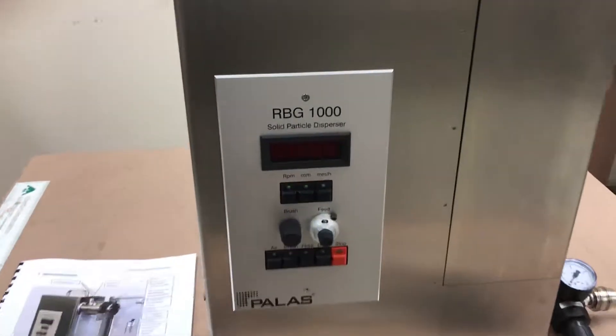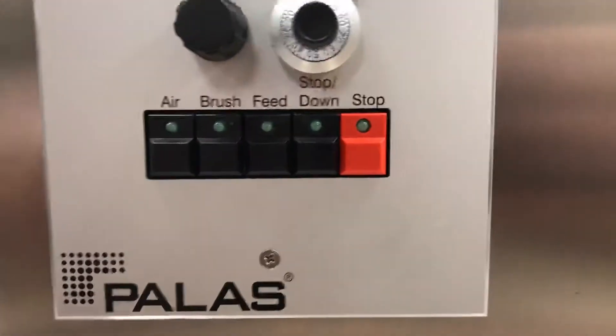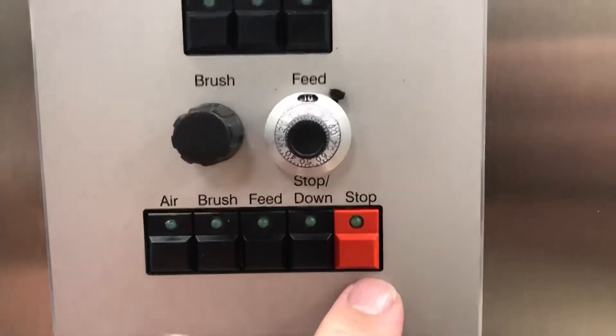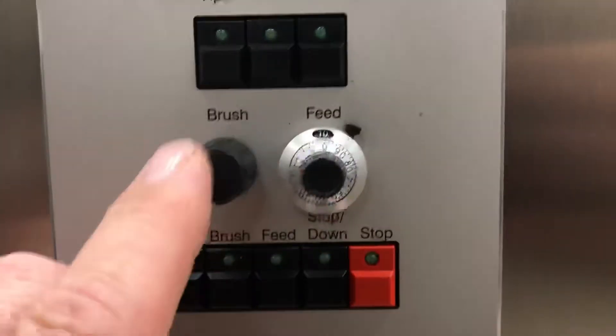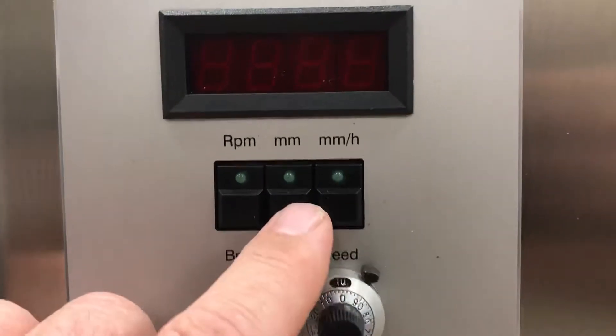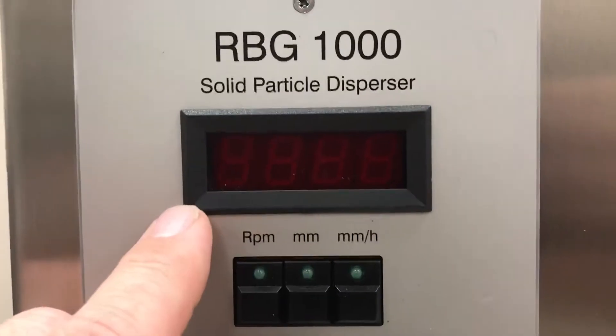What I'll do is look at the front panel. On the front we have buttons for air, brush, feed, and down stop. We have a few potentiometers for brush and feed. Above that we have buttons for RPM, millimeters, millimeters per hour, and above that we have an LED display.